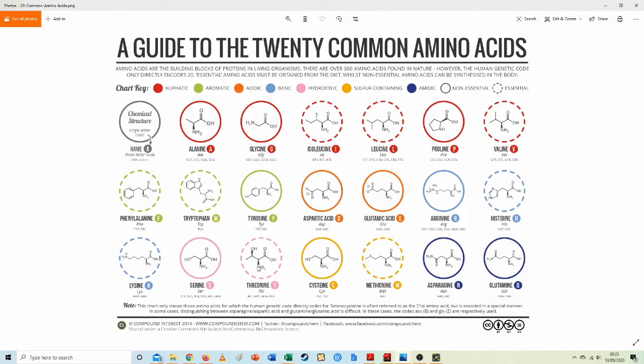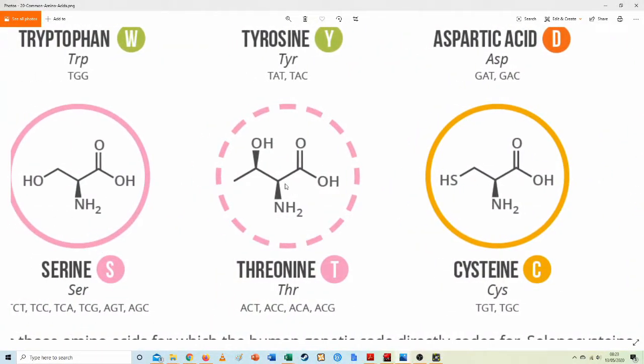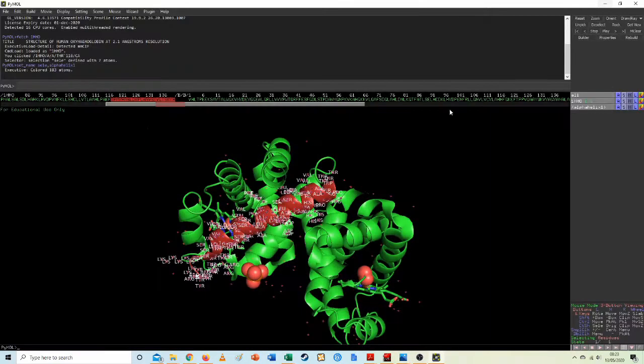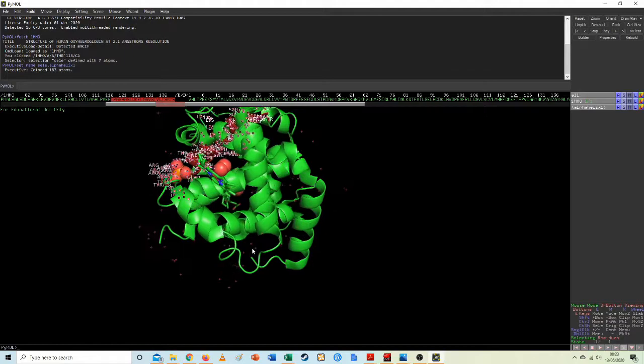Okay, that's not what I wanted to do. Yes, we've got quite a few of this one as well. Now, it's very worth noting that because we've got a hydroxyl group here, an OH, that's going to be able to form hydrogen bonds. So this bit here, very polar. So that's really what all those are going to be doing there. Right. Okay. Let's pick another one.